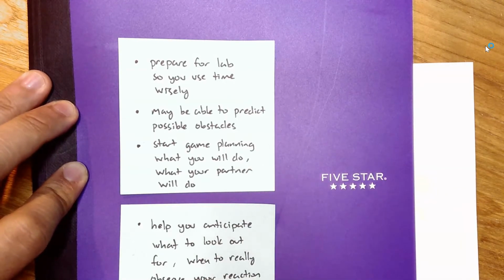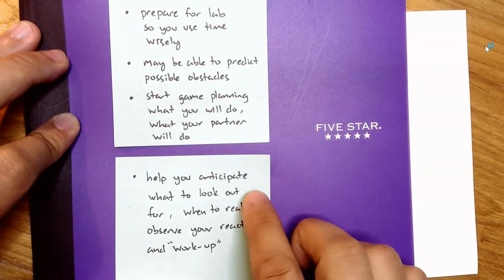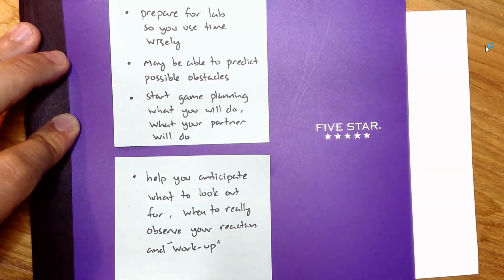Third, maybe as you write through your pre-lab entry, you can start game planning. What do you plan to do during the lab, and what would your partner do during the lab? Can you delegate the different tasks between you and your partner? Also, it will help you anticipate what to look out for. When do you really need to pay attention during the reaction?